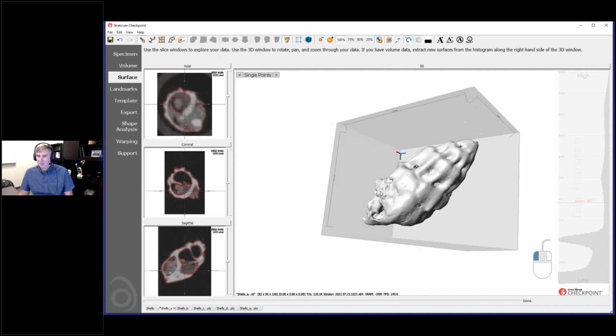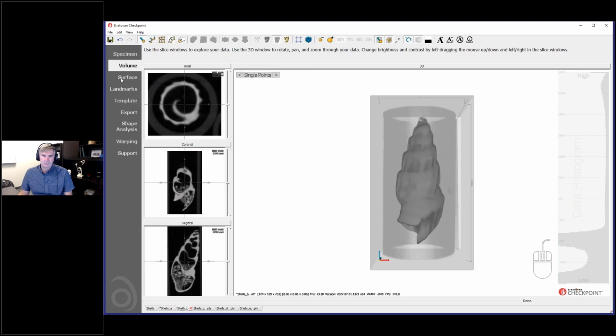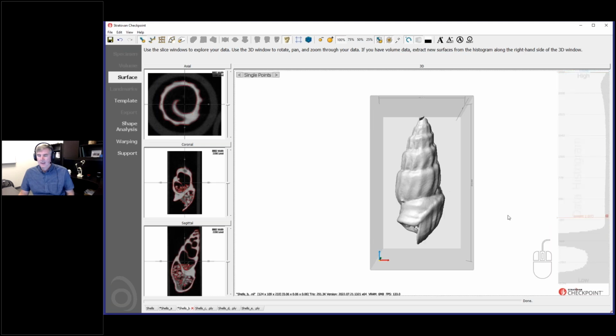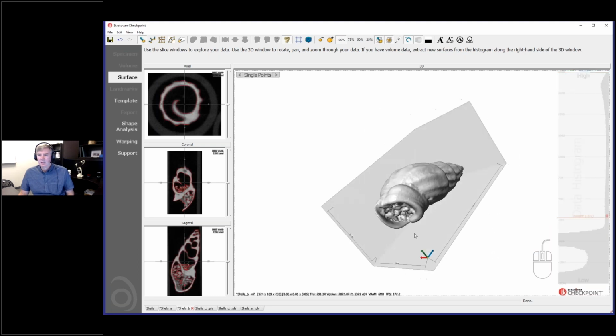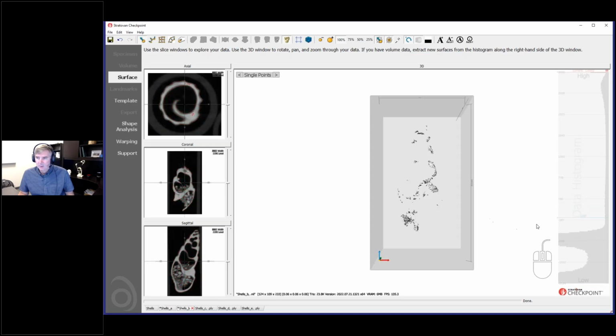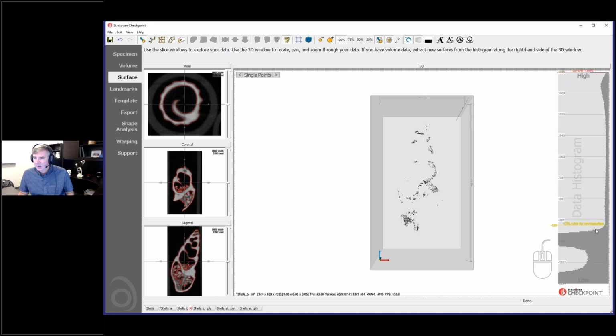So I'm going to get rid of these 2. I'll try this guy here. Look at this one. This one picks some weird value. So let's pick another value down here. One thing you may want to do is use the same value across your specimen. So in this case, I used 92 for my ISO value. In this case, this is minus 327. So I'm going to close that. I'm going to go up to 92, or as near as I can.